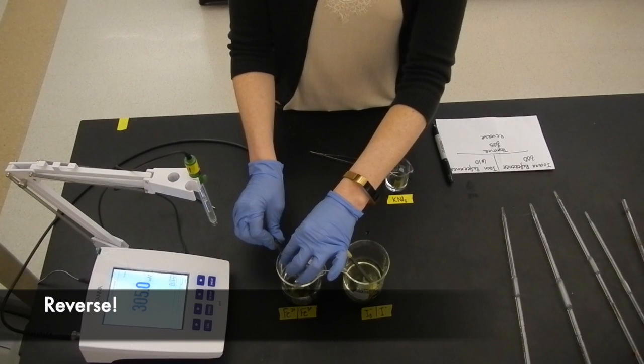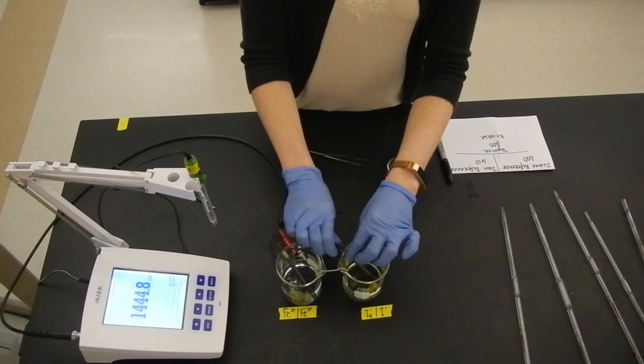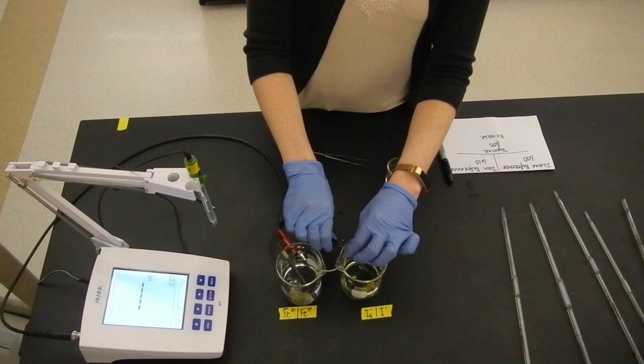Finally, swap the red and black alligator clips of the voltmeter and once again record the millivolt reading.